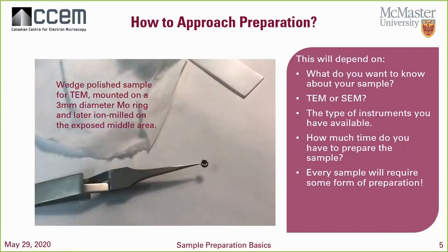Now, how do I want to approach preparation today? I just want to show you what it is that we want to know about the sample, right? That's one of the questions that you should ask when you come in. And let's say you're seeing a technician at the CCEM and you say, hey, I want to prepare this. I want you to ask questions about the sample. Why do I need to go into the TEM, right? Why TEM? Why SEM, right? What instruments do you have available at your suite, right? Luckily for us at the CCEM, we have a lot, but not a lot of other labs do, right? How much time do we have to prepare the sample?